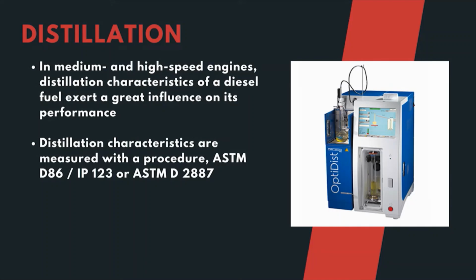In this continuous distillation apparatus, the sample is taken, it is heated and the hot vapors are cooled and condensed, and the distillate is collected in a measuring jar. At specified intervals of the volume collected, the temperature is noted, and that will determine whether the product is accepted and whether the product can be considered to be on spec.